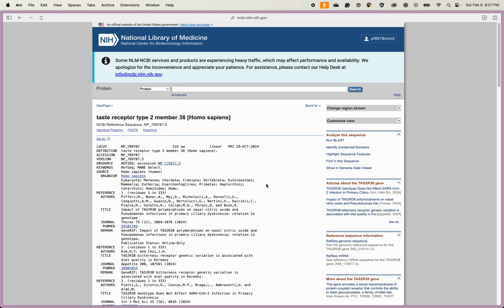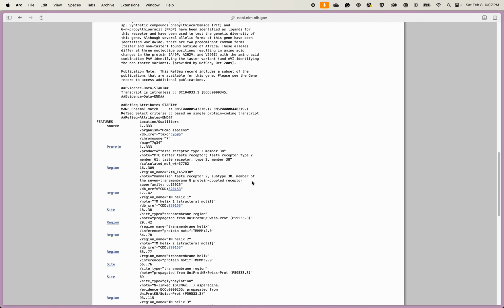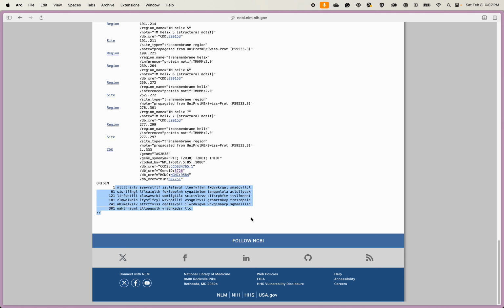Just in case you never know what's going on in Benchling, you can go down. Here's the sequence. Now you can copy and paste it from here, or since it already has numbers, you can just do a little count, a sanity check. So 262, right? This is 241, 42, 43, 44, 45, 46, 47, 48, 49, 50. So if this is 50, this has to be 60, 61, 62. So it's around here. So let's look at this in Benchling. Let's remember it's AAFIS.